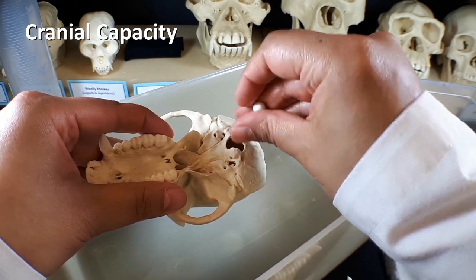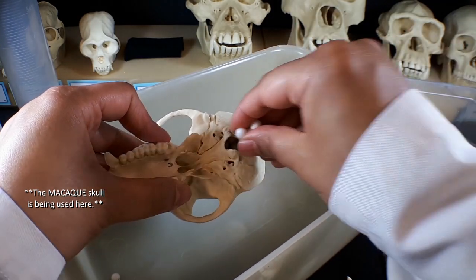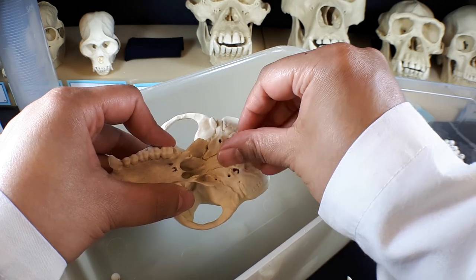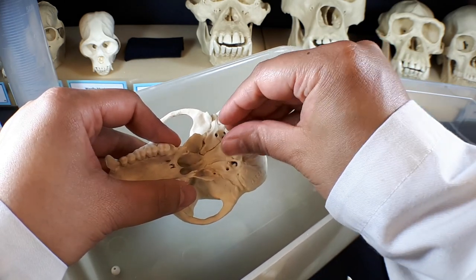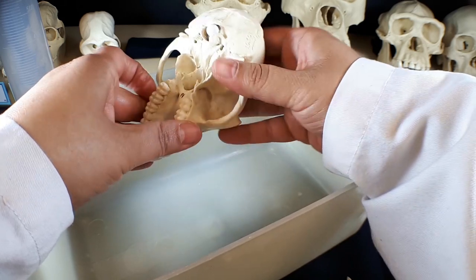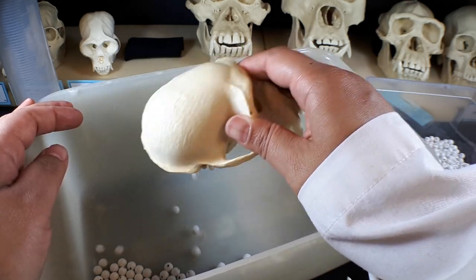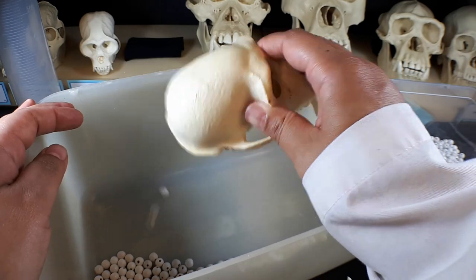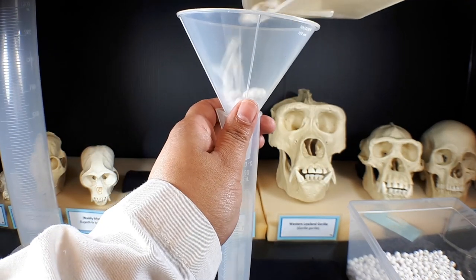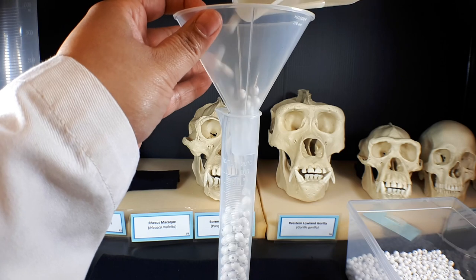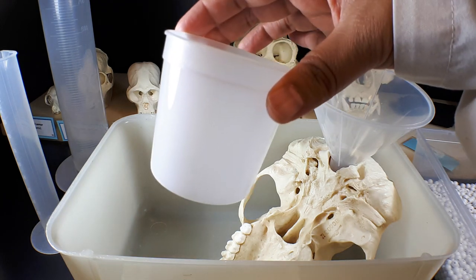Measure the cranial capacity by carefully filling each skull with beads. Work over an empty bin to catch any stray beads and be extremely careful not to damage the skulls during this procedure. Once the skull is full and the beads are level with the opening of the foramen magnum, you can dump the beads into the empty container. Once the skull is completely empty, carefully pour the beads into a graduated cylinder and record the total volume needed to fill the cranium. While the smaller skulls need to be filled by hand, you may use the funnel and plastic cup to assist filling larger skulls.